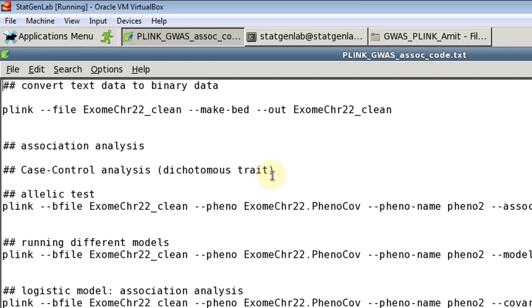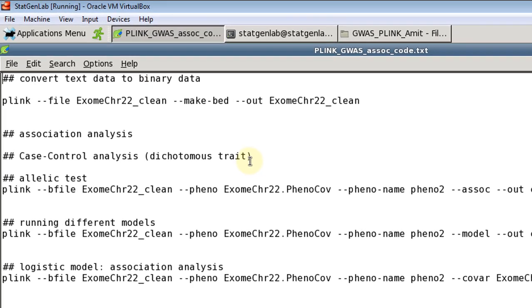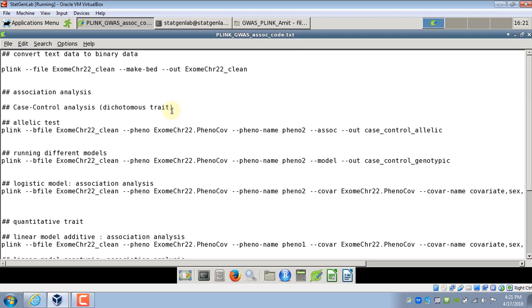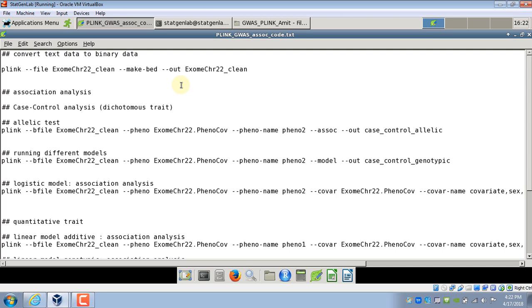For GWAS in this video we are only going to cover GWAS for unrelated individuals. Now Plink can also handle related individuals in certain cases. So for dichotomous outcome it can handle TDT and for continuous data it uses a permutation test but that is outside of this video. In the quality control using Plink video we discussed how to create data in Plink, how to transform into different Plink formats. So if you do not know how to use Plink, again I would recommend you to watch that video first before moving to this GWAS video.